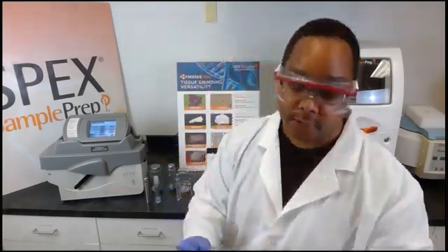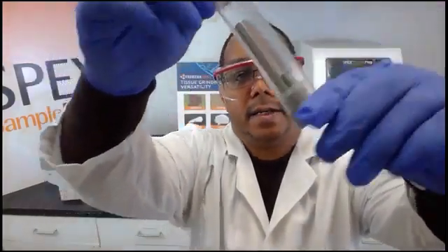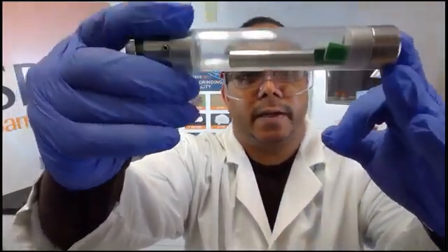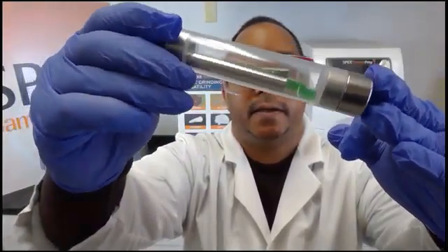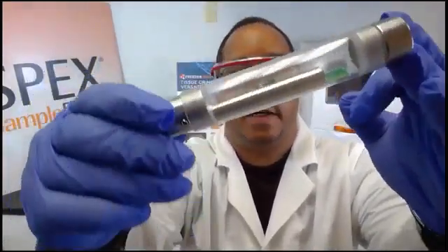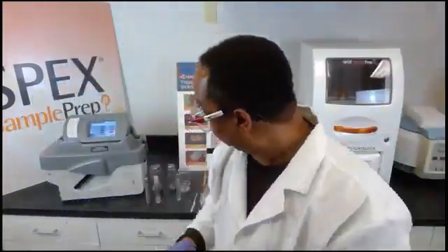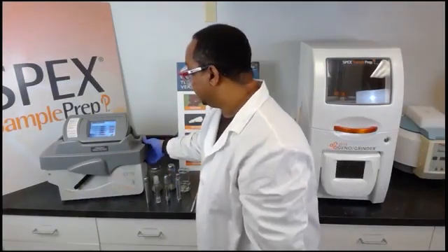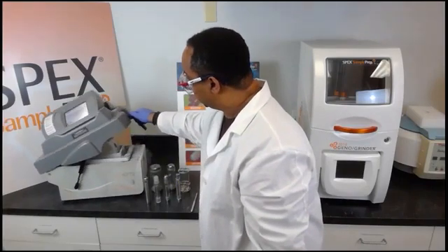When loading a sample like circuitry board, the sample must be cut into smaller pieces, approximately 1/4 inch in size. This will enable the impactor to move back and forth against the end plugs to crush the sample. To open the lid, we grab the latch, unhook, and release.